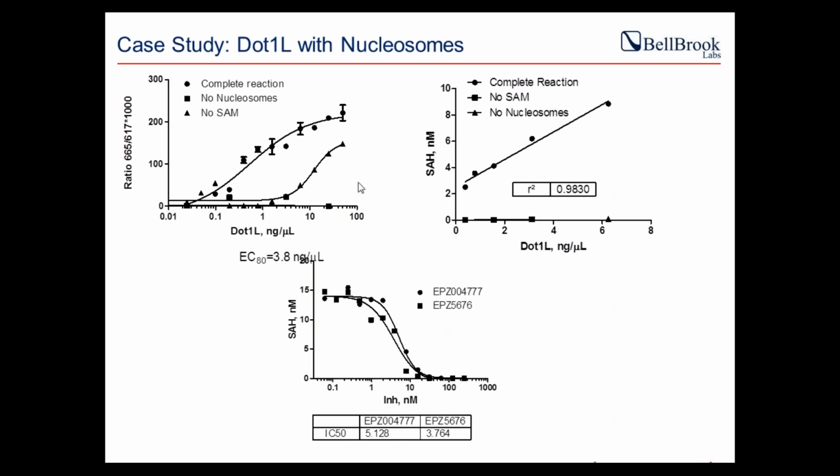And then we tested DOT1L with nucleosomes. As you can see, people who have worked with nucleosomes would agree with me, it's different from lot to lot, and we do not make our nucleosomes in-house. We purchase them from Reaction Biology, and there is always that lot to lot variation. We have to qualify each lot, but it works really great with the AptaFluor assay.